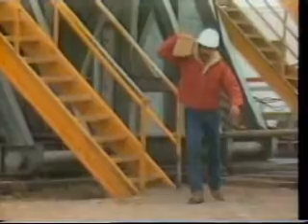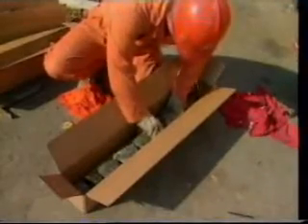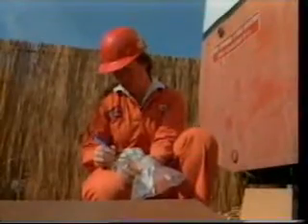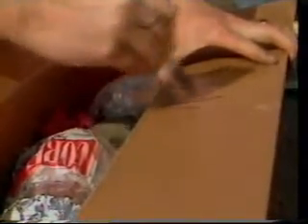Whole cores, for example, are removed carefully from the core barrel, wiped, and laid out in order. Total core length is logged and each foot or meter marked. Lost core is logged at the bottom of the cored interval, unless drilling times or mud loggers indicate it should be elsewhere. A brief lithologic description should be made by the well site geologist here, or later in the laboratory. The cores are then preserved according to the expected duration of storage and objectives of the coring program.